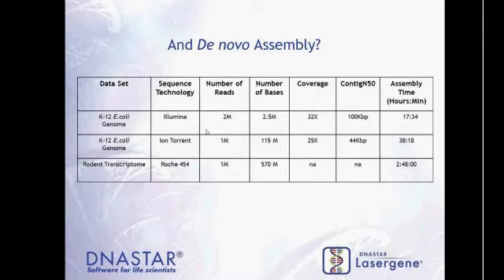Most of our de novo assemblies are microbial and small eukaryotic assemblies. If you have a lot of RAM on a computer, then you might do smaller to mid-sized eukaryotes. Our software is also commonly used for de novo transcriptome assemblies, and it performs quite well. And those are some of the more difficult of all assemblies because we can have a mix of cDNAs that are present at varying abundances, and that creates contigs of widely varying depths. Many assemblers reject that type of de novo assembly. Our SeqMan engine does an excellent job.